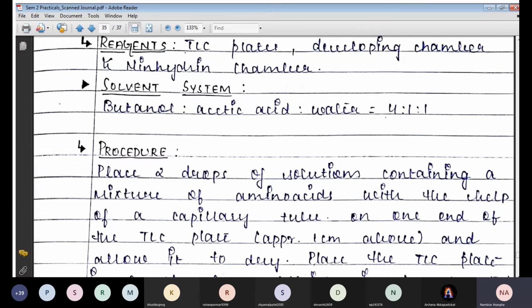Within a few minutes, the places where our finger came in contact with the solution are colored blue. So why is this blue color seen in our fingers?